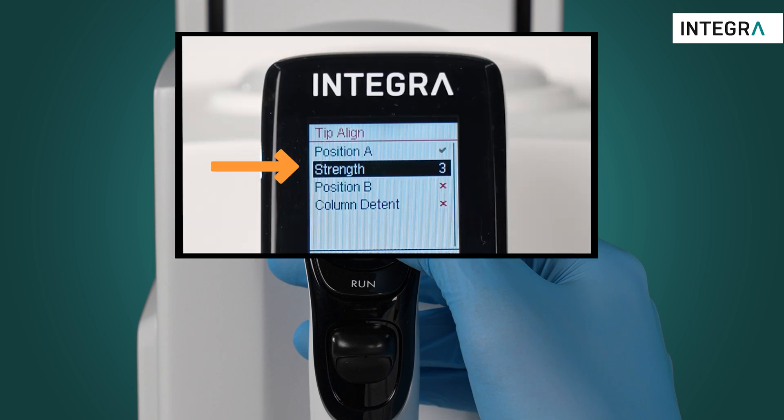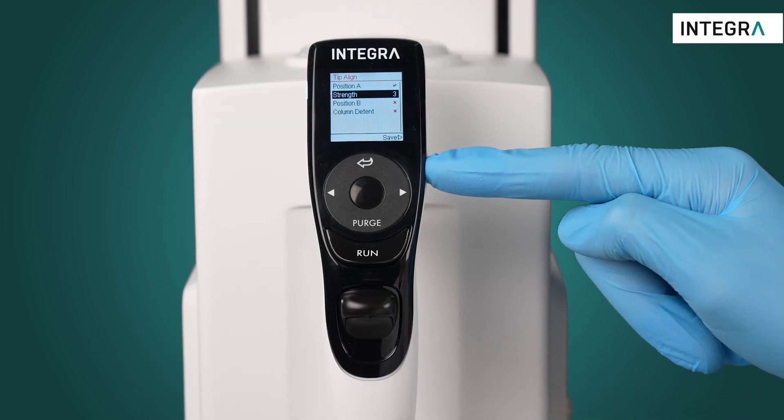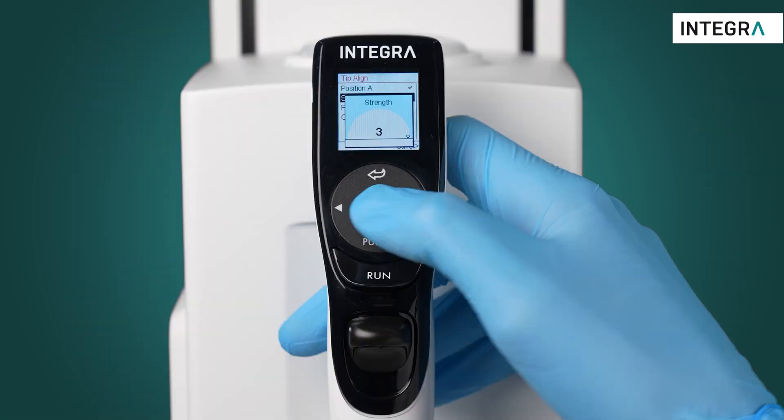You'll notice that there are three strengths. The highest is strength three. When activated, this will essentially only allow you to move the pipette to exactly where you defined in the head alignment.